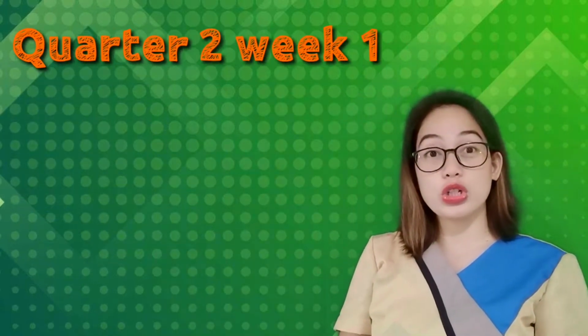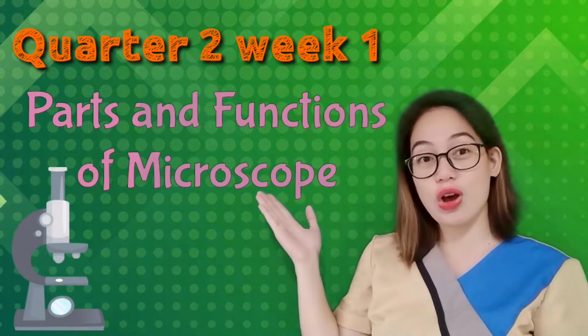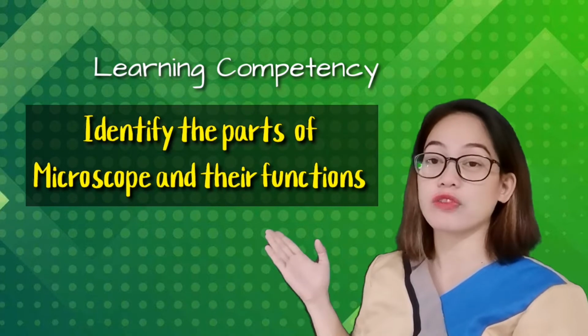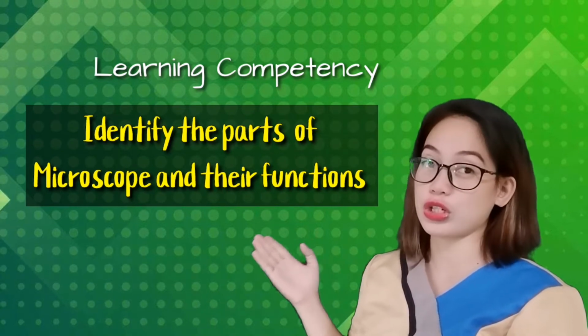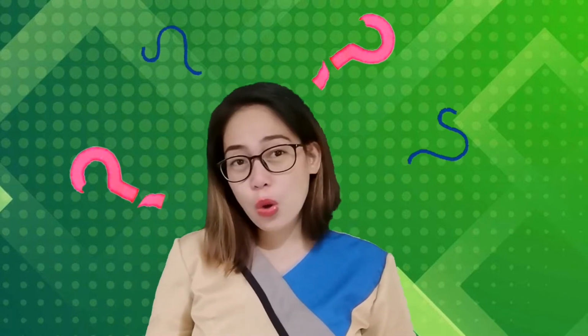For our Quarter 2, Week 1 topic, we will be talking all about the parts and functions of the microscope, with the learning competency: identify the parts of the microscope and their functions. Okay, class, do you know what a microscope is?